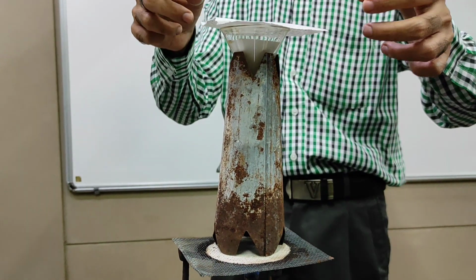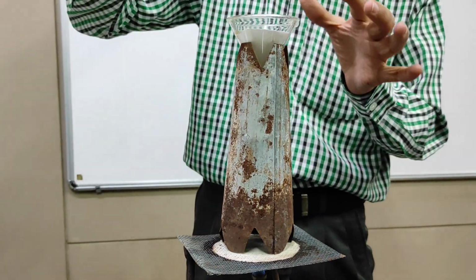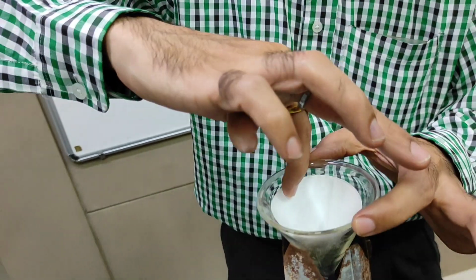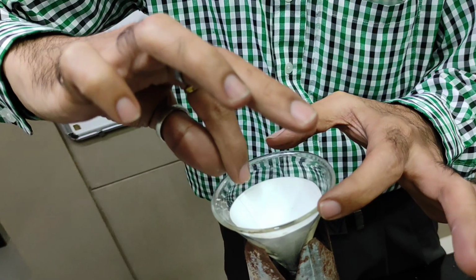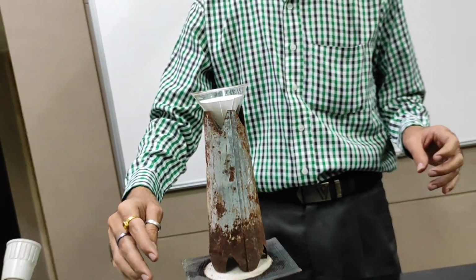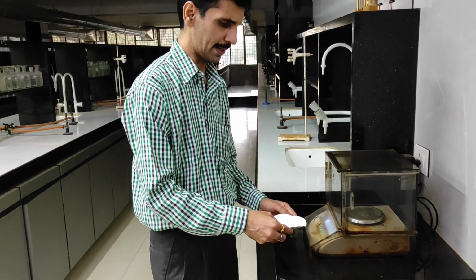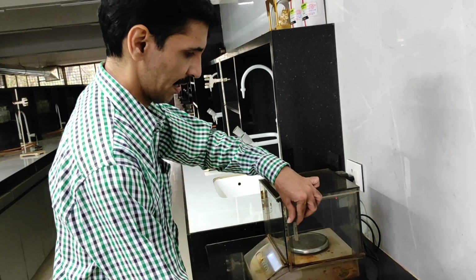Now we'll just check whether it's dried or not. As I told you, this is the way we can do it. Can you see this? We can now completely rotate this filter paper. Okay, can you see this? So this is an indication that it is dried completely. Okay, so now we will put off the burner and proceed towards the weighing. Now we can start with the weighing part. The final weighing is W2, as I mentioned.